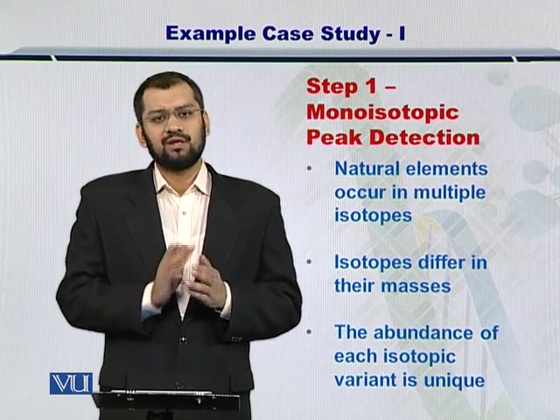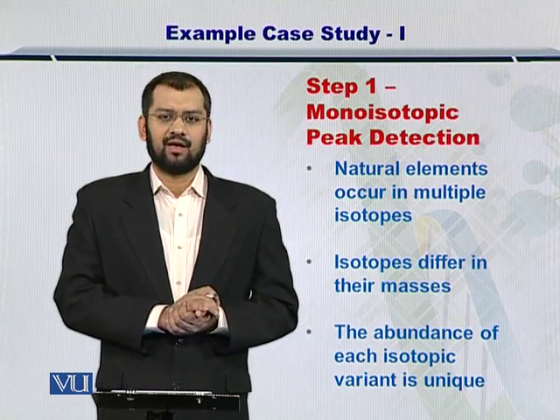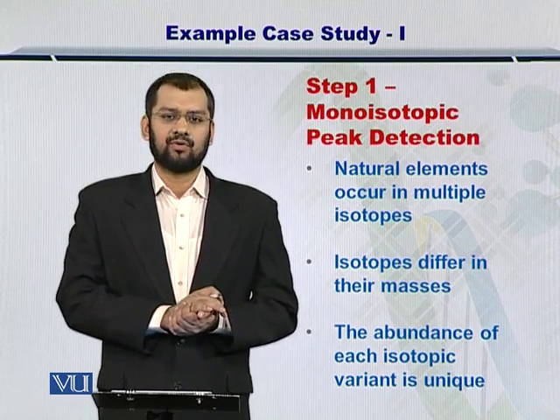So once you have obtained the monoisotopic mass, then this is the MS1, and you can use it towards the measurement of the peptide and protein.